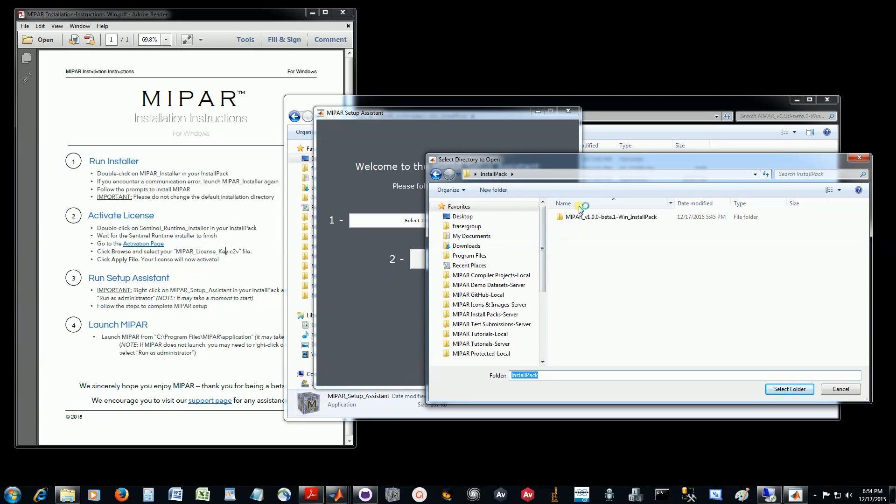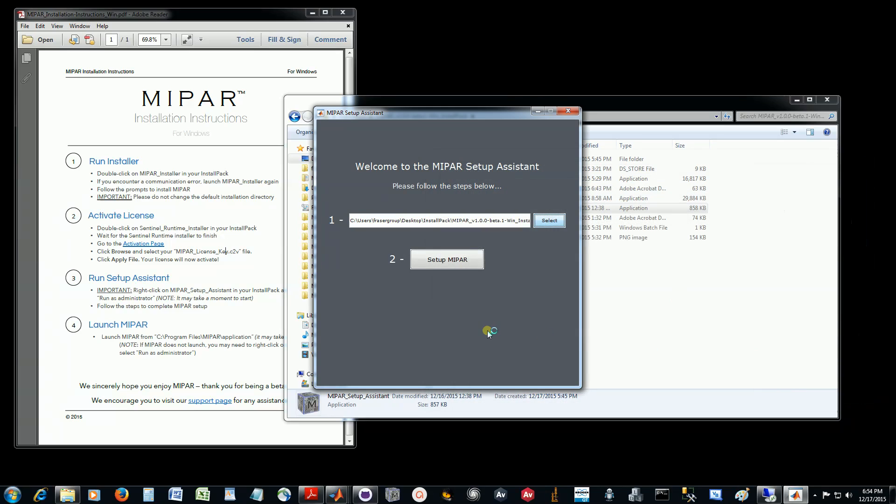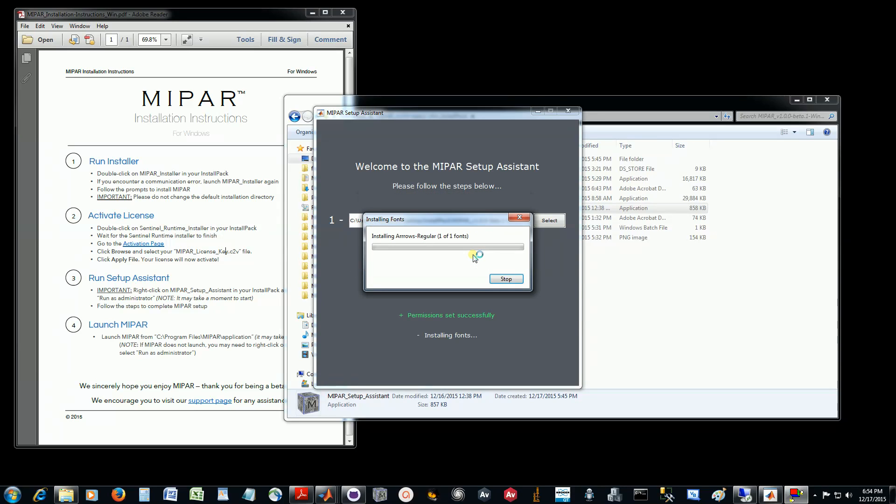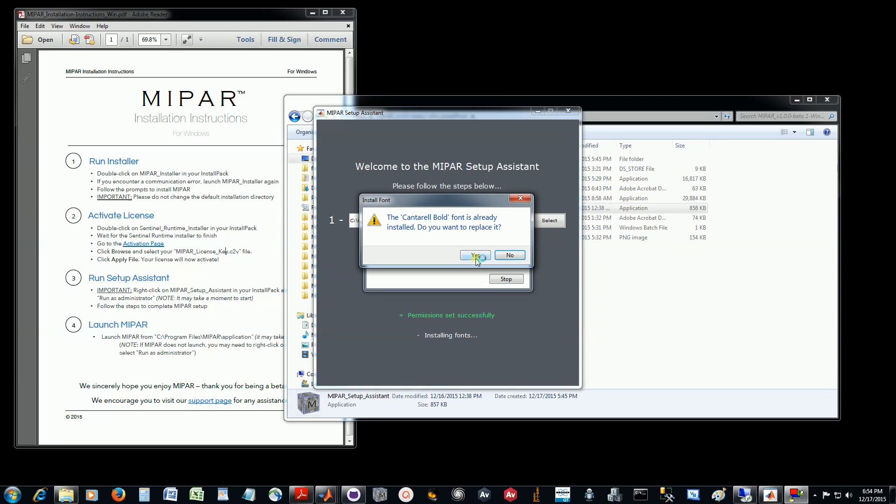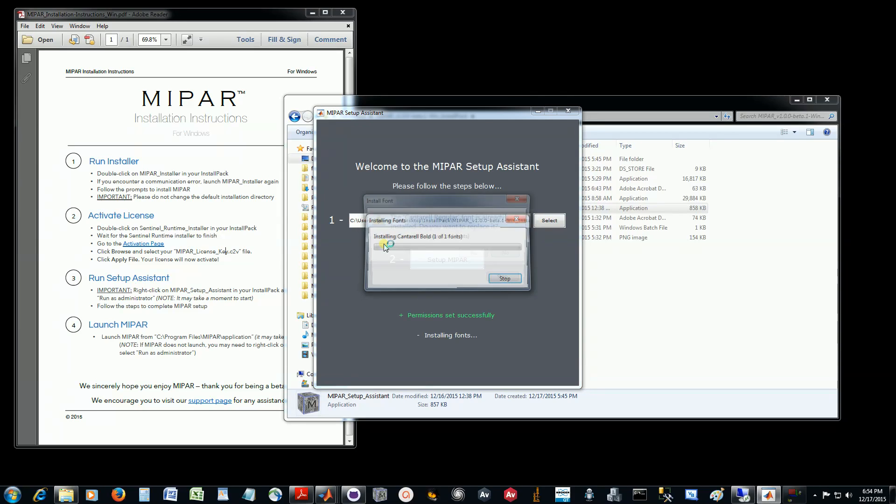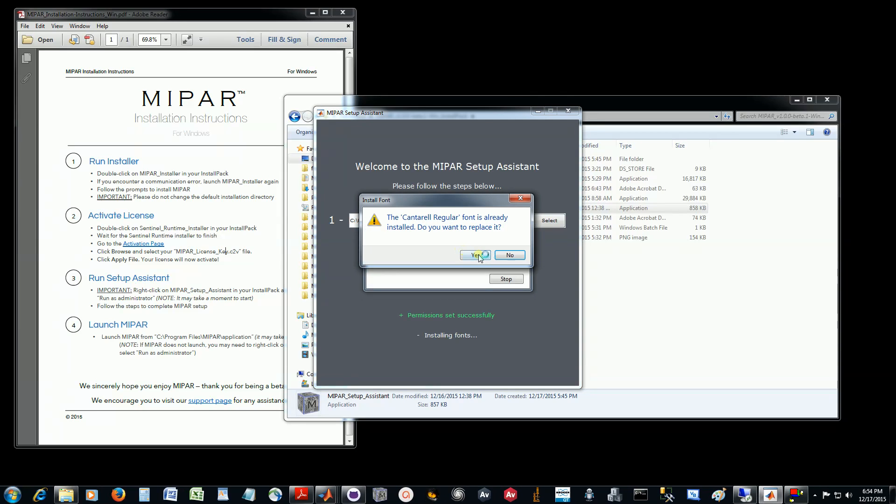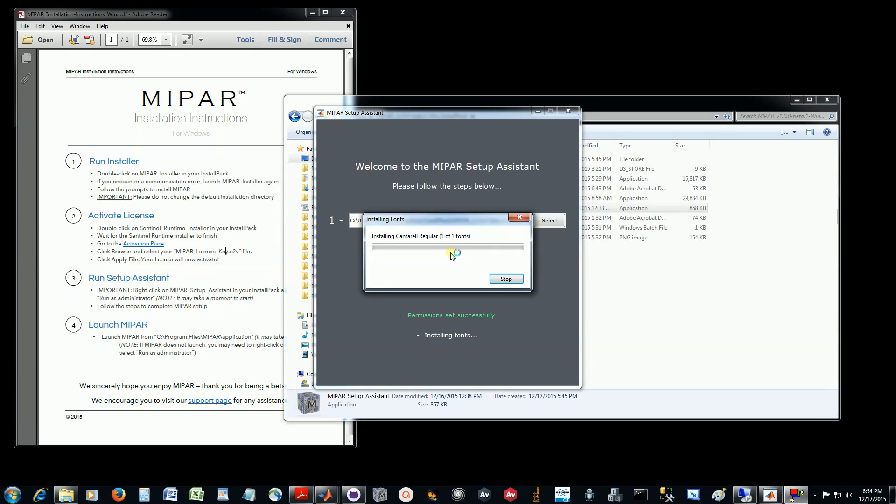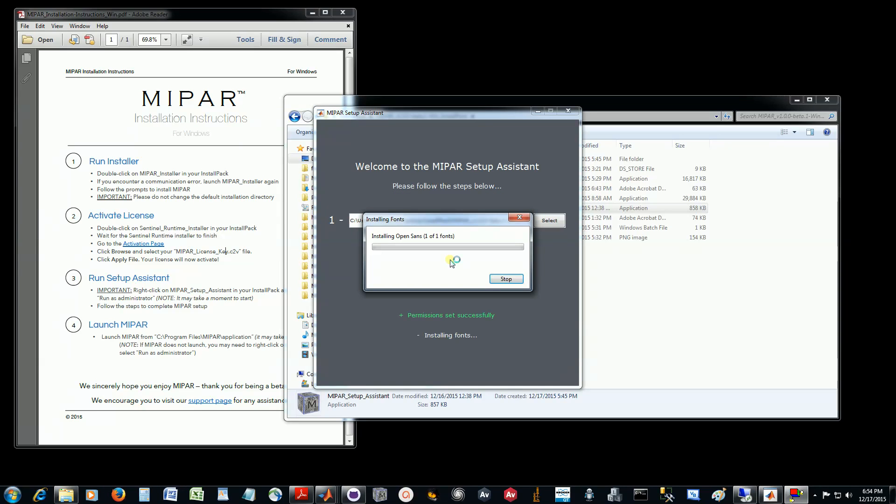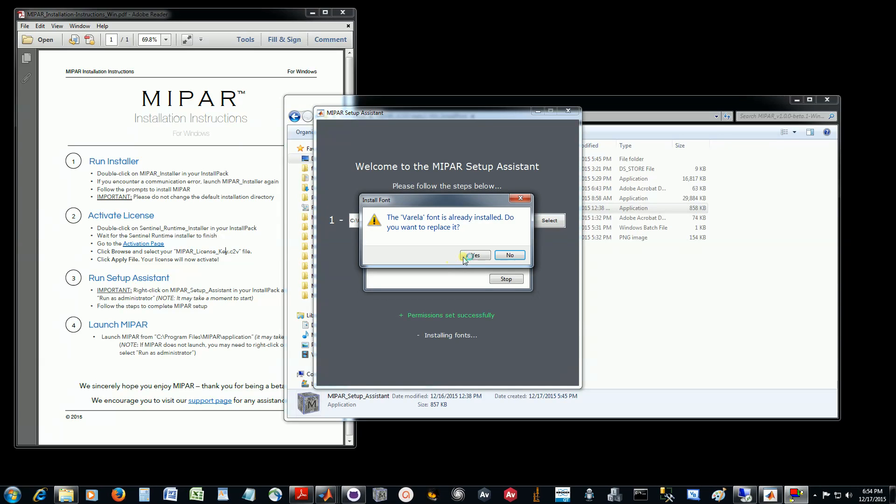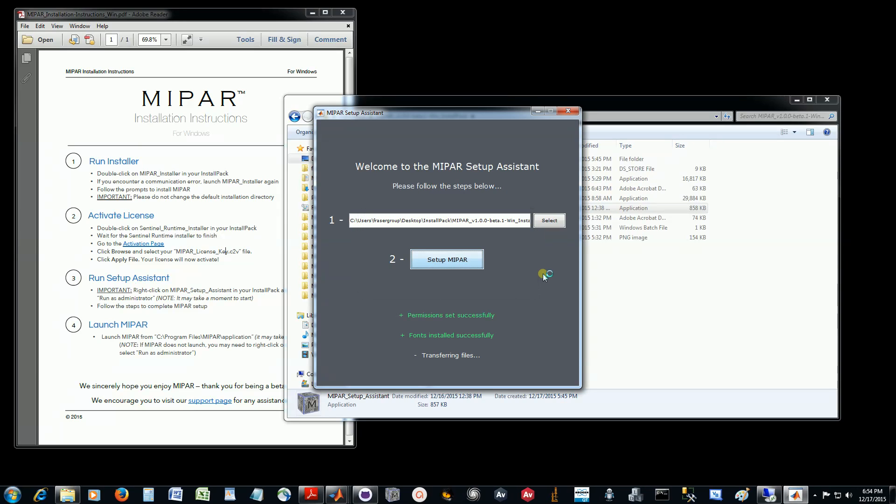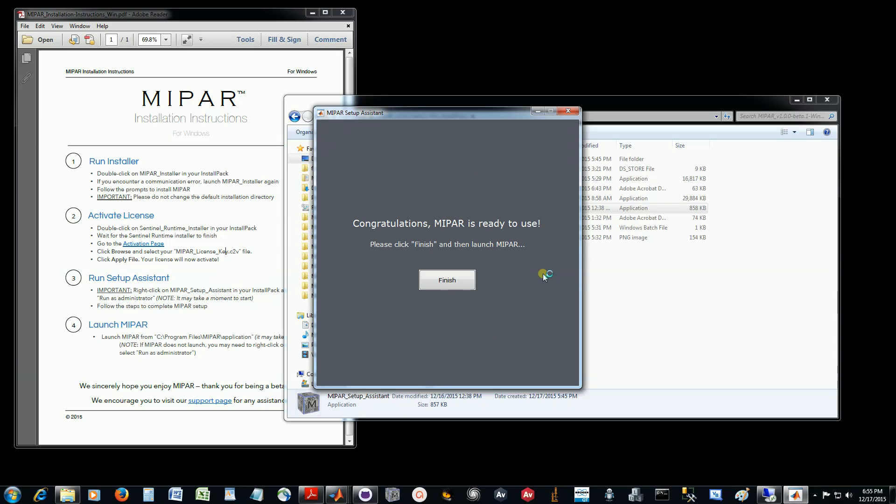I have mine right here. You'll then click Setup MyPar, and this should just perform three operations, hopefully successfully. I already have all of these fonts installed, so I will just click Yes to install each of them. Yours will just proceed without needing to click Yes. Just got a few fonts to install to make MyPar look correct on your system.